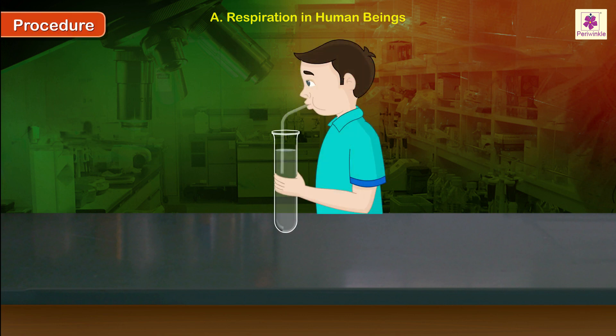Place one end of a straw in the test tube containing the solution and gently exhale slowly and continuously through the straw. Observe and record the color of the solution.